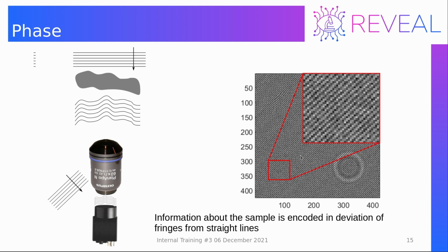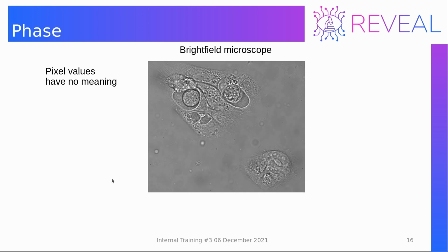But it's still a simulation. So let's now look at a real example. This is the bright field image of a biological cell, and as I said, you see something. You can see some gradient structures. You can see basically the structure of the cell. However, not everywhere. For example, in this region it disappears. It is transparent. So there are regions where you see nothing.